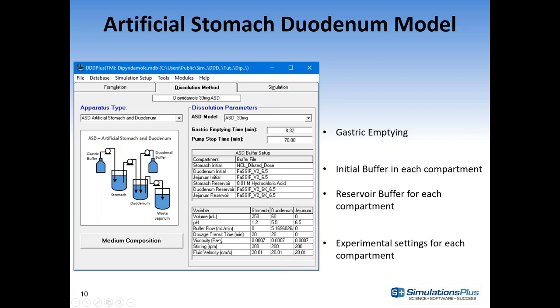You can set buffer flows and transit time for a solid dosage form — for example, an IR tablet can be manually moved from compartment to compartment. Otherwise, solids released into the fluid will transit based on gastric emptying and flow rates. This is one of the flagship new models, allowing you to look at transit between compartments and the precipitation that happens going from the stomach to the duodenum for a basic drug.